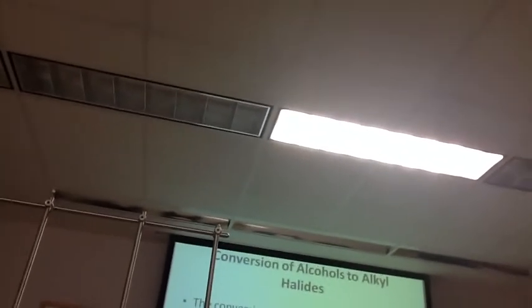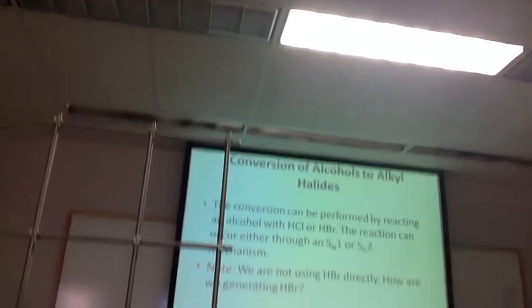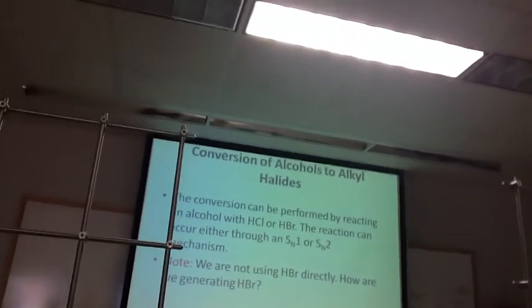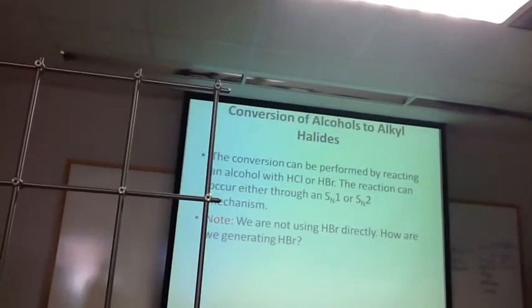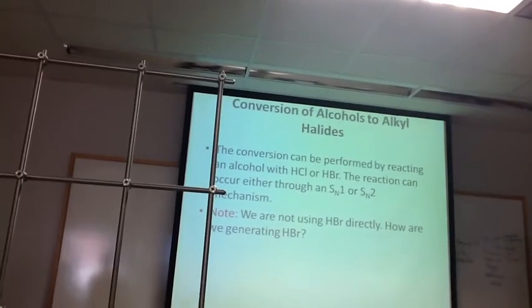Anyway, this week we'll be starting the conversion of alcohols to alkyl halides. It's going to be so much fun, I promise. Okay, so this one we've done, if you have your sheet, you can follow along with me. We're pretty much going to go along through that. As it says on your sheet, in your pre-lab, we're going to react it with either hydrochloric acid or hydrobromic acid. You can use either one.